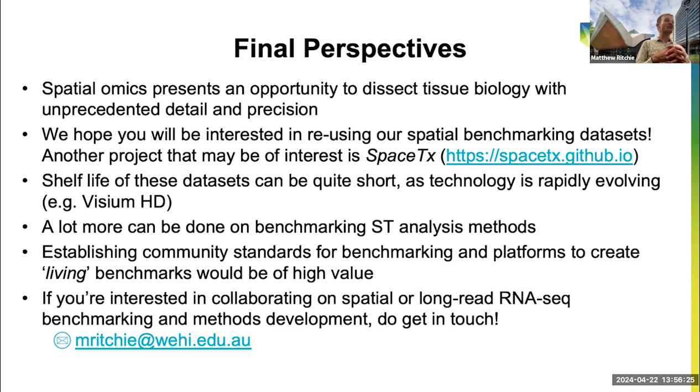The field is moving quickly though, so the shelf life of these data sets might be quite short. Maybe all of these data sets are obsolete very soon. I guess those Visium technologies won't be available forever. I guess stereo-seq are always releasing new versions. And again, more commercial companies are coming on board with version 1 and then version 2 and lots of different versions. So it's a challenging field to keep up with, but I guess we need to start somewhere. So hopefully this data is a start.